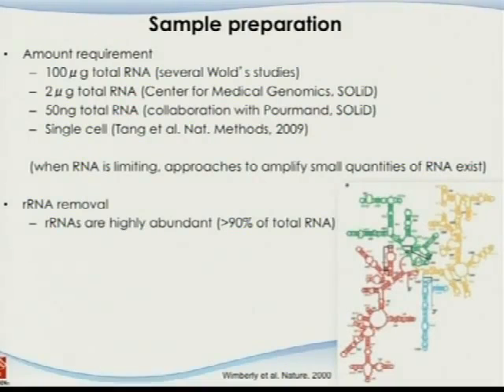I mentioned this ribosome removal issue, and he said, since our genome is so small and it's bacterial, and we use one lane of Illumina, it should be plenty. Even though 90% is ribosome RNA, we get rid of it and just analyze the remaining 10%. We still can cover this genome pretty well.